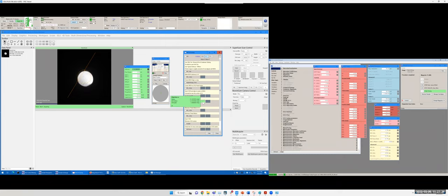And then I want to move this wheel A to have the same center as the circle I have drawn on the CCD. Okay, now it's aligned, okay? So I want to stop wobbling. And if I put the MOA in, you can see MOA is still off. So I want to move MOA. Okay, now MOA is roughly aligned, but the MOA shape is not perfect. That is the following alignment. So now I want to align the MOA shape.